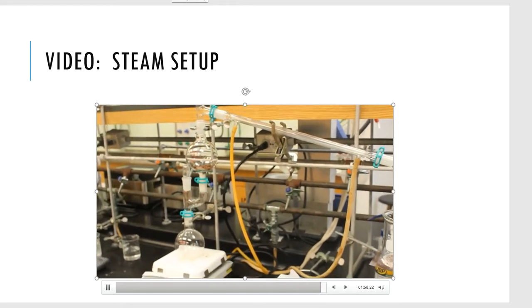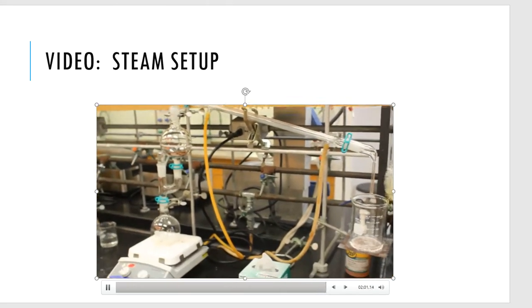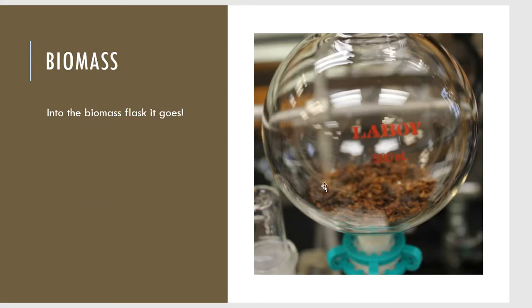Make sure you get that into your lab notebook. What you're seeing in this image is a very simplified version compared to what we did in the past. The old setup was a mess — students hated it, everyone hated putting it up. We've gotten better over time. Here is our current steam distillation setup. The cloves go into the biomass flask — you can see what they look like before the distillation. Pause the video if you need to write down your observations.